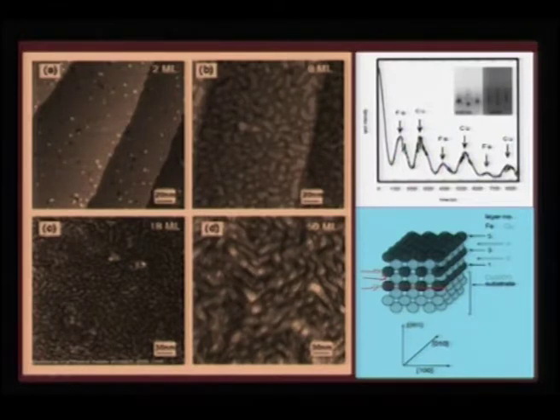These small dark spots are those first layers which are fully covered by the second layer, that is copper, and this gray scale is nothing but the second layer. So, in the initial growth mode we can try to map whether it is a continuous growth or whether it is a column growth. If it is a 2-dimensional growth, then it is easy for us to map.